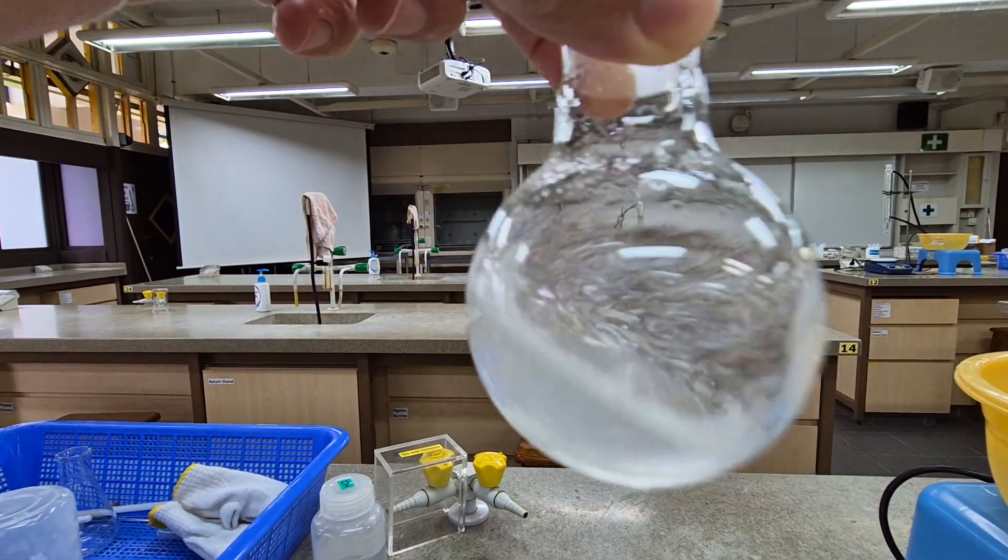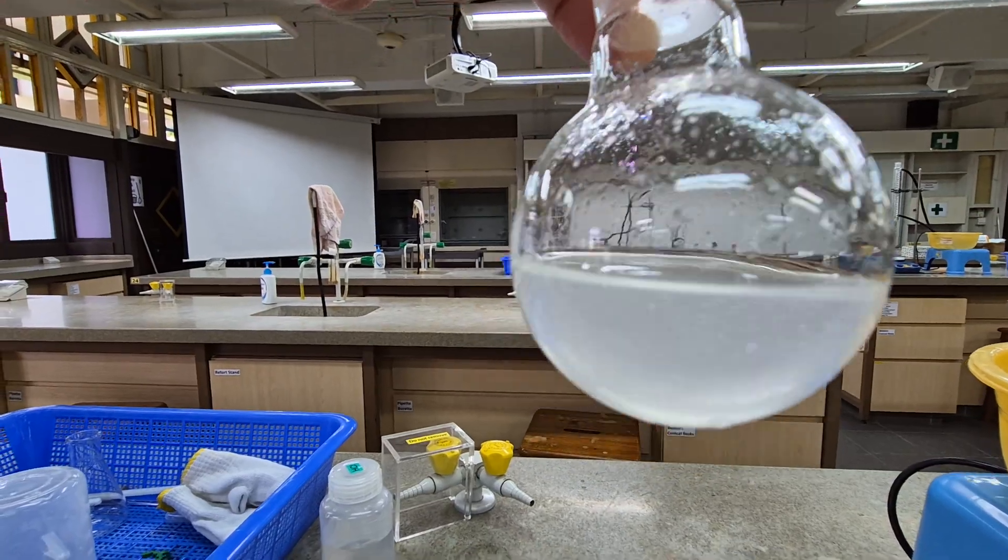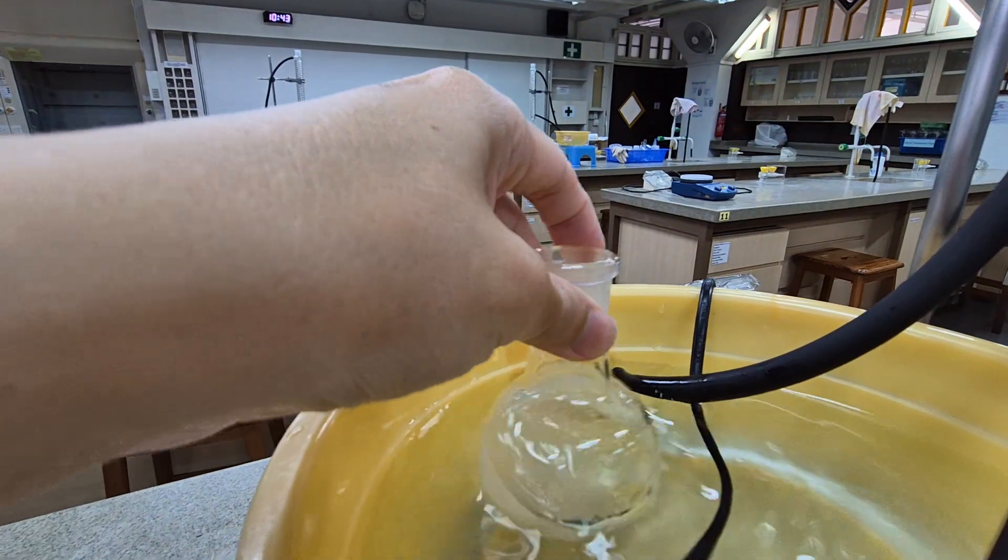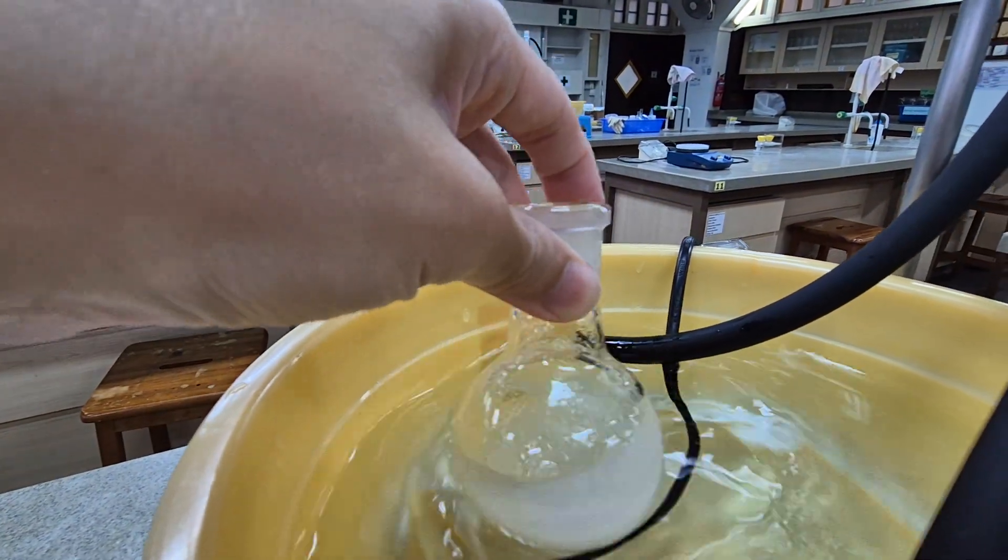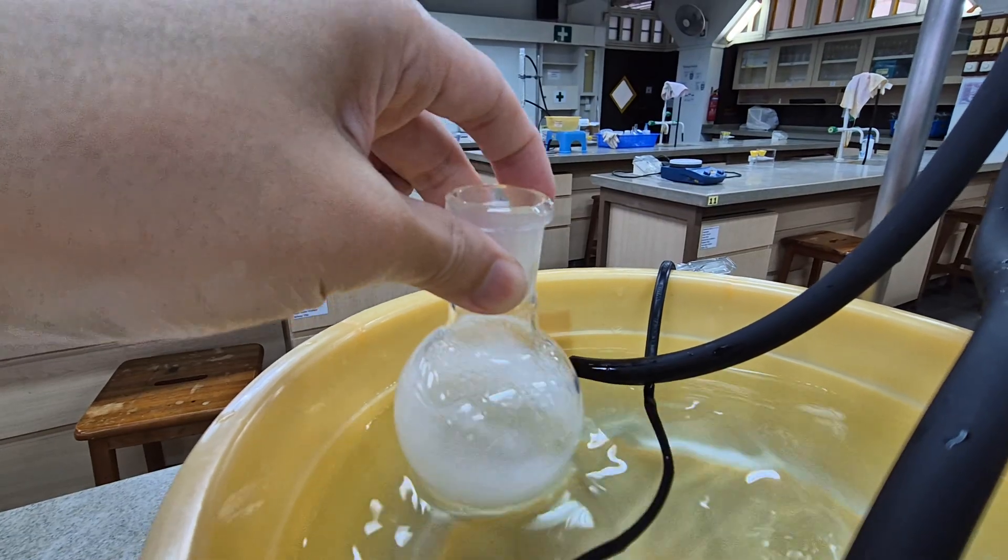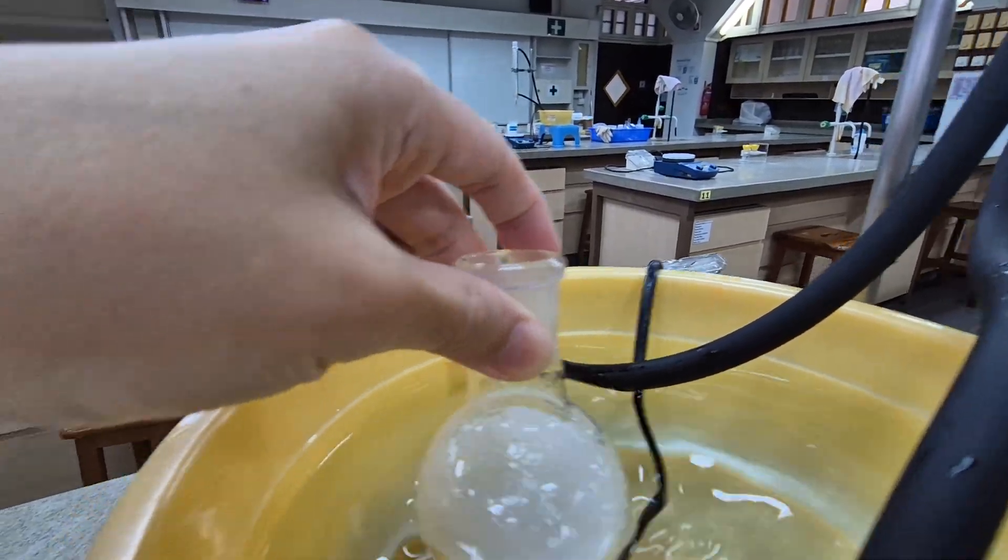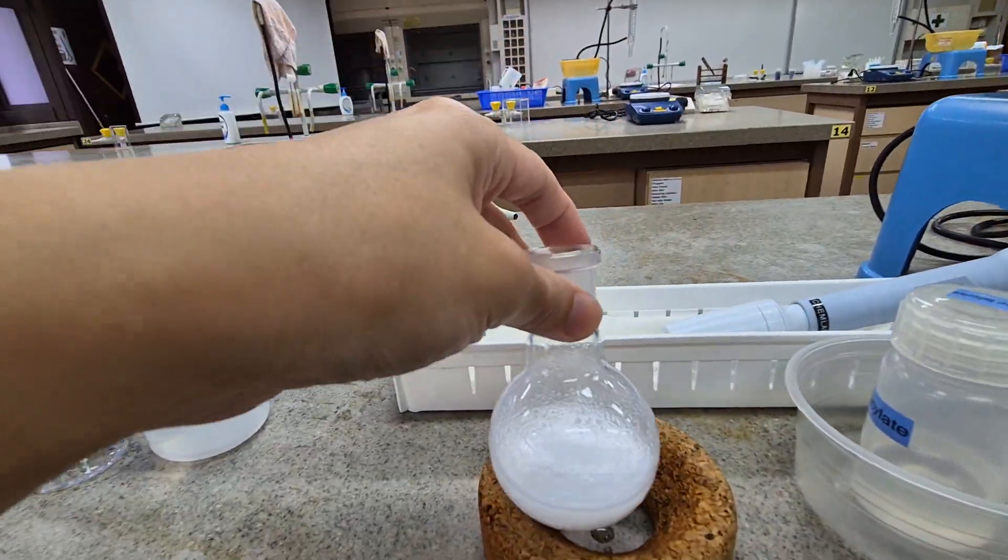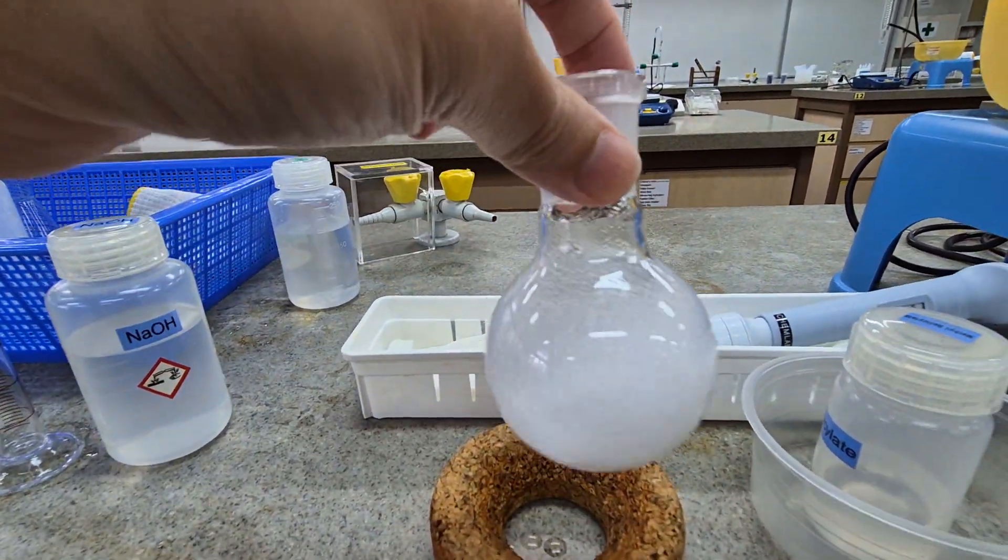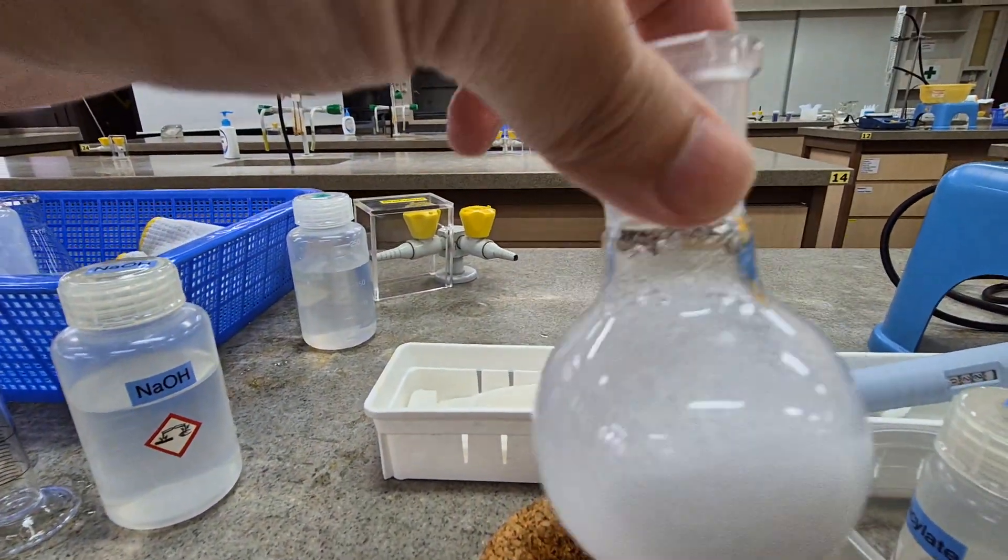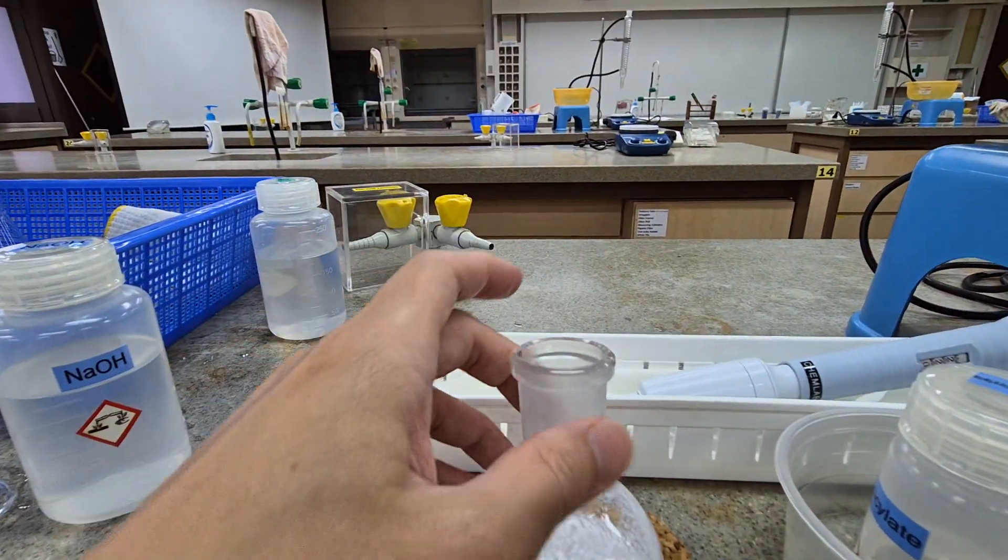If I cool it further, then more and more of it will appear. I think it's quite obvious now. You get quite a bit of white precipitate coming out. It's a bit difficult to swirl now because you get quite a bit of it.